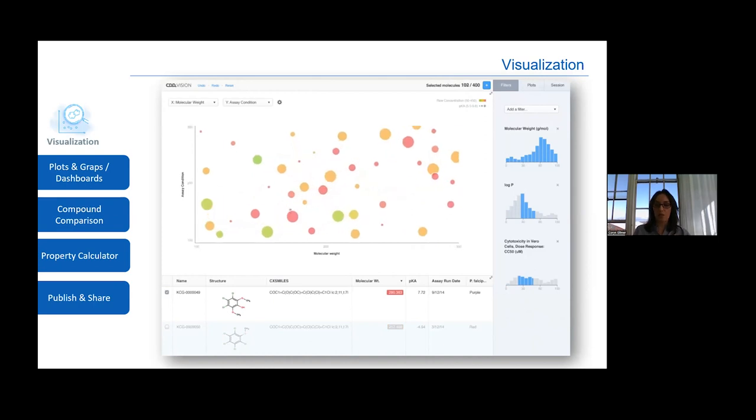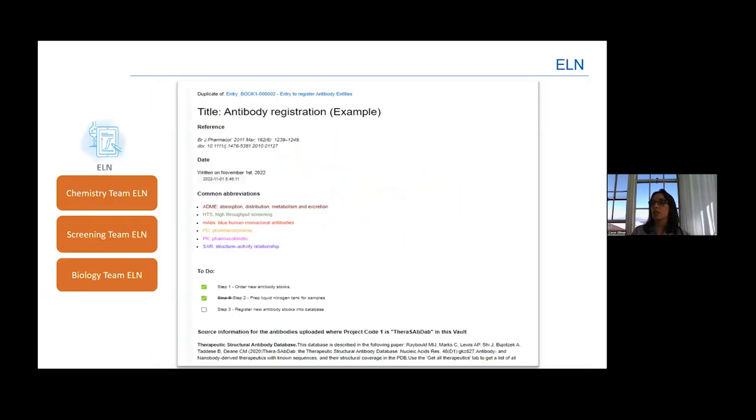The last module is electronic lab notebook. The CDD Vault ELN is made both for chemistry and biology teams. It is for storing your structured and unstructured data. What is great about ELN is that it can be used for drawing structures or reactions and then linking it back to the entity registration system.